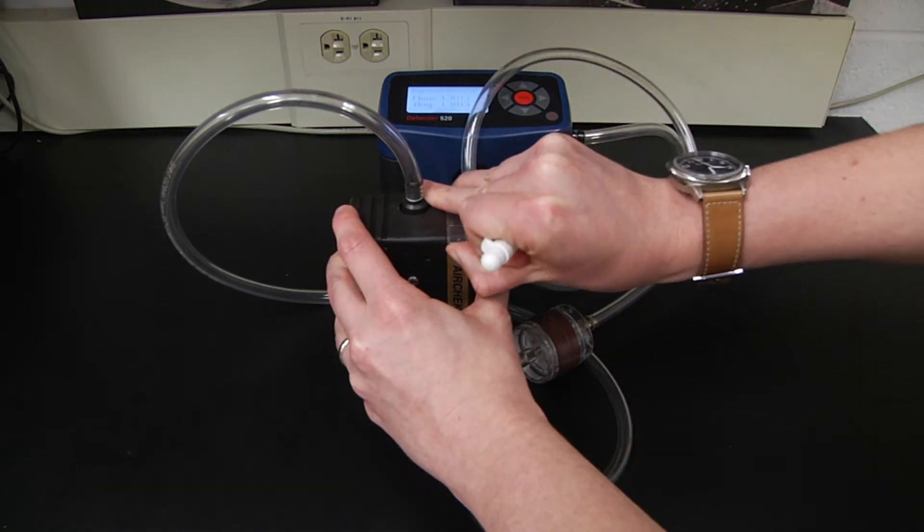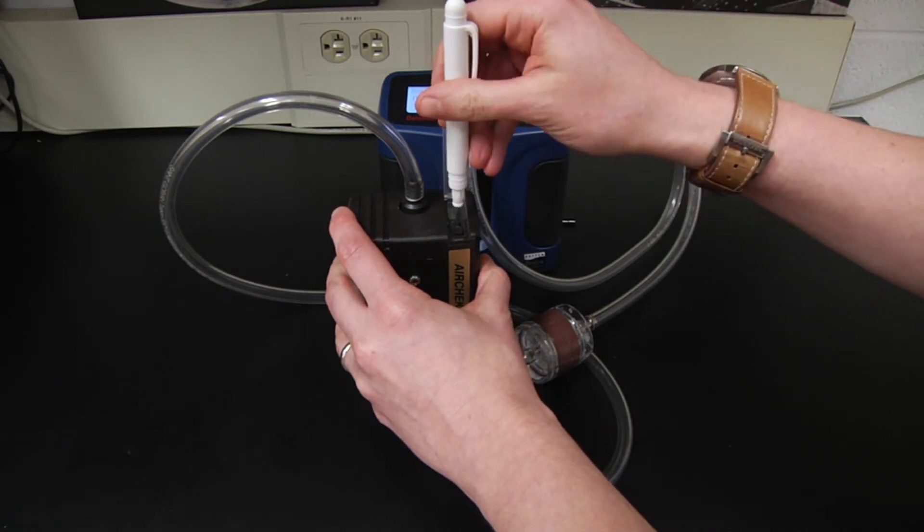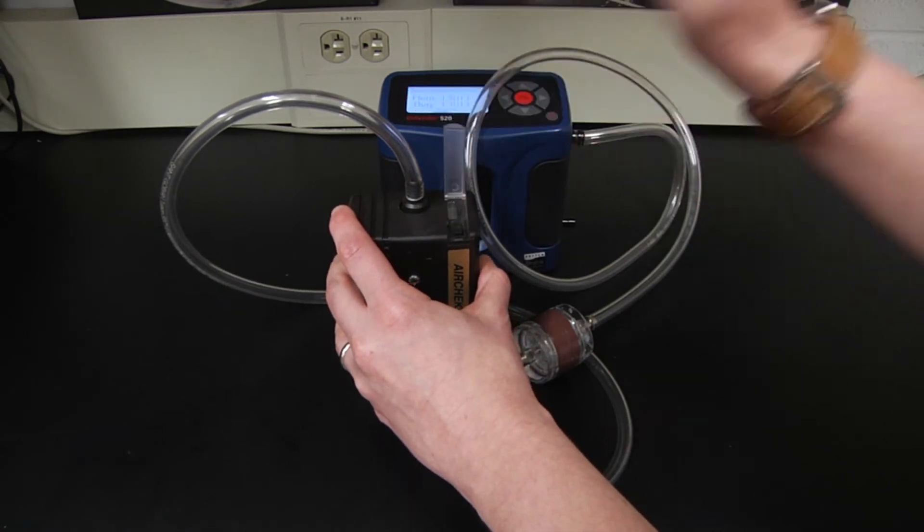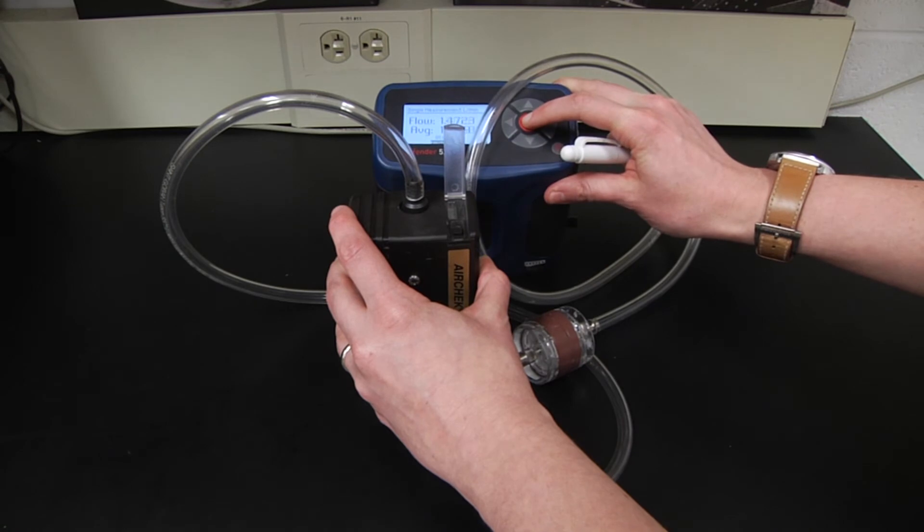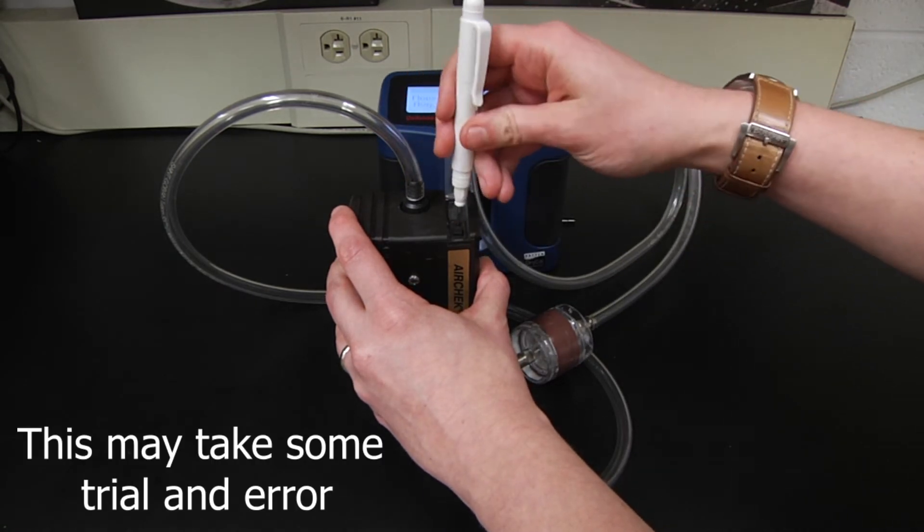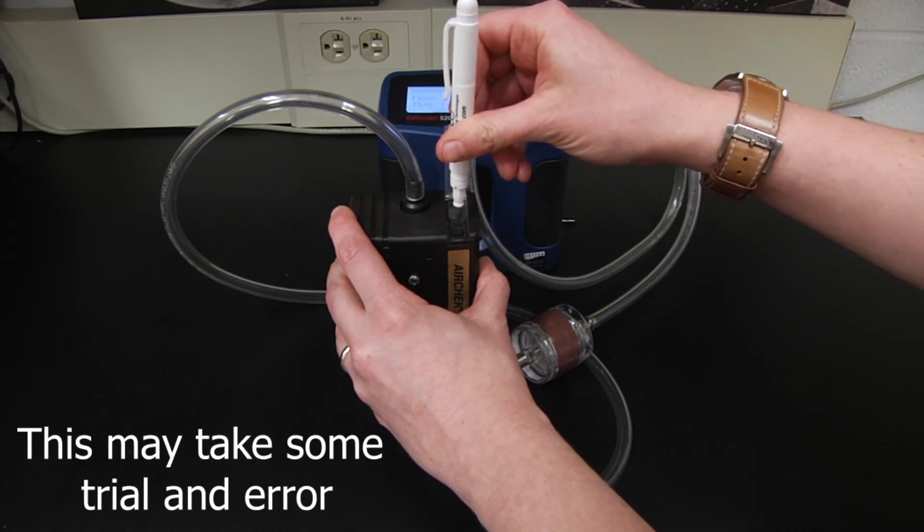Use the screwdriver to adjust the flow rate to the level required based on your sampling time, required sample volume, and approved analytical procedure. In this case, we're using NIOSH method 0500 for total dust.